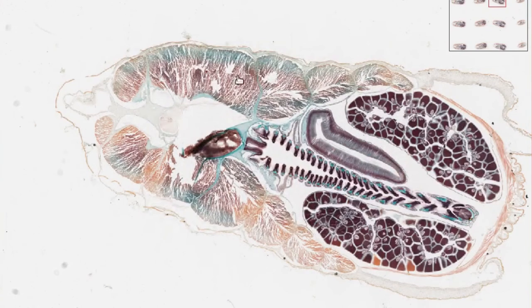So this looks like a more cranial section, so more towards the head. This structure here is going to be the pharynx. We can see the gill slits here. And then this, just to the side of it, will be the hepatic diverticulum.